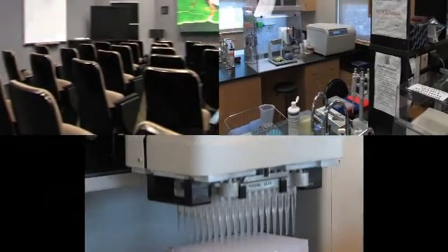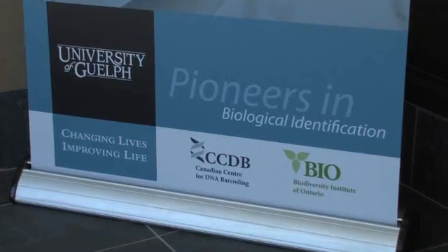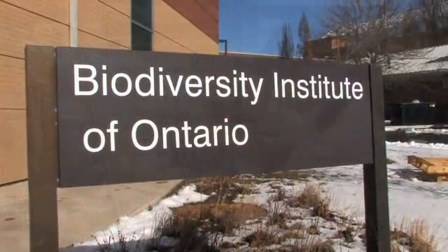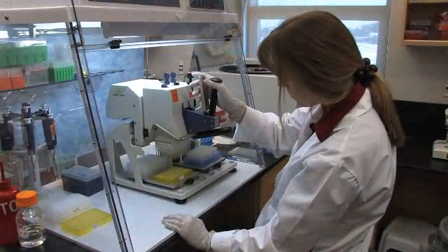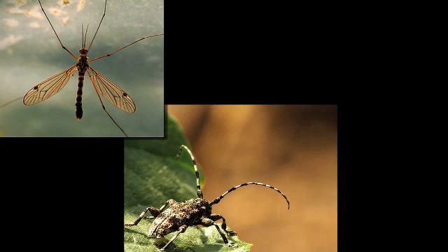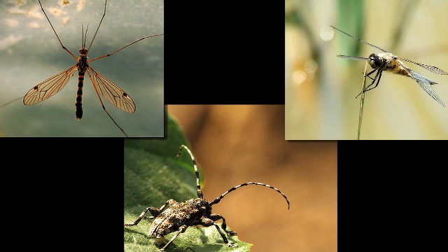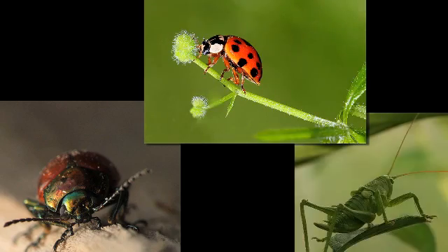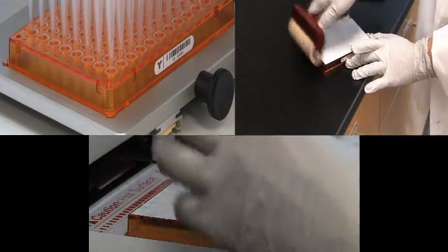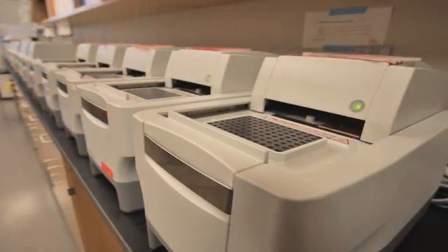With the help of the Canadian Centre for DNA Barcoding, or CCDB, the International Barcode of Life Project is creating a barcode reference database of short, standardized gene regions. Their goal is the identification and discovery of five million specimens from more than 500,000 species over the next five years. Here we will show the CCDB's protocol for DNA amplification using PCR.